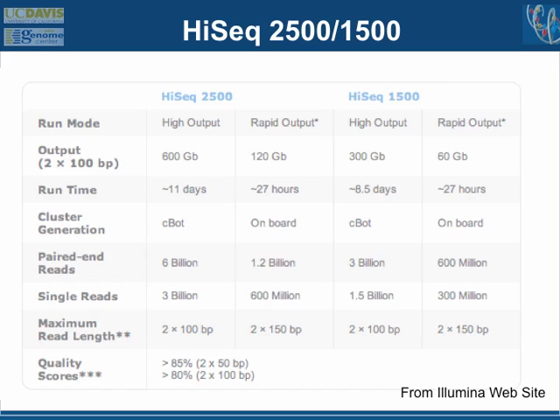So what you really want is a sequencing method that has a knowable and predictable error distribution, and hopefully is close to random. None of them are really random, but some of them that have been developed are more biased than others.